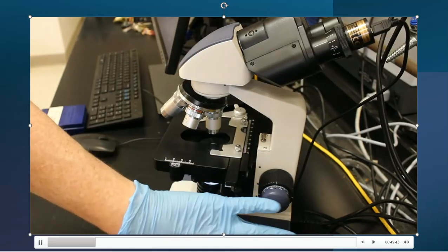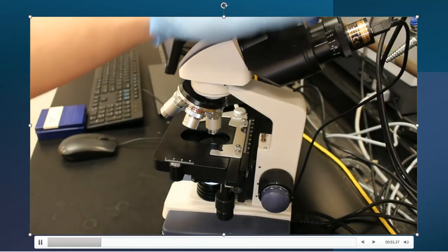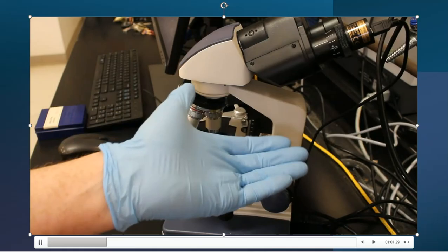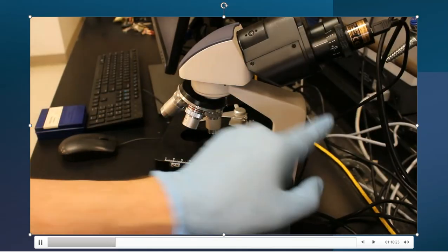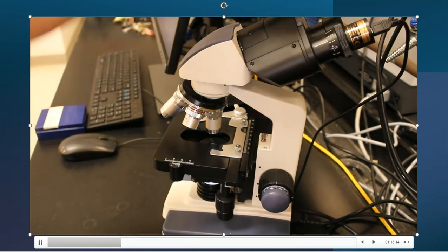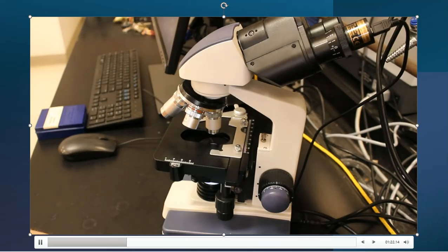So this is our microscope that you're seeing here on the screen. Up here at the top, this is an eyepiece area. It's just really right off the screen almost. And that's what you normally would look through with your own eyeballs. But I hate those types of microscopes. And what you're seeing here is an actual camera that is connected to our computer screen, so that way we can open up some software and we can look at a computer monitor instead of through the eyepiece to see our view. So that's going to help us a little bit because we're going to have to analyze a lot of slides, and that can cause some eye strain on you if you're not very careful with these microscopes, or if you've got to look at them all day every day. So it's nice and convenient.